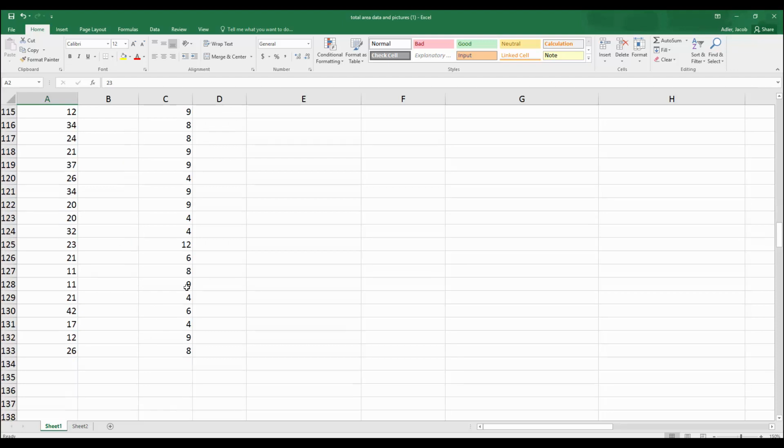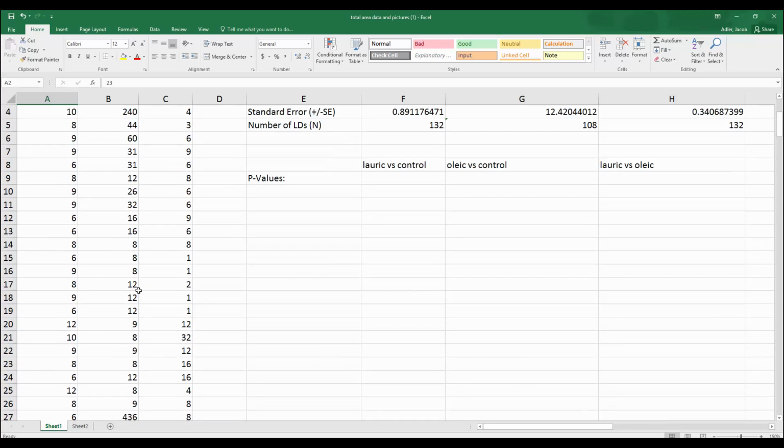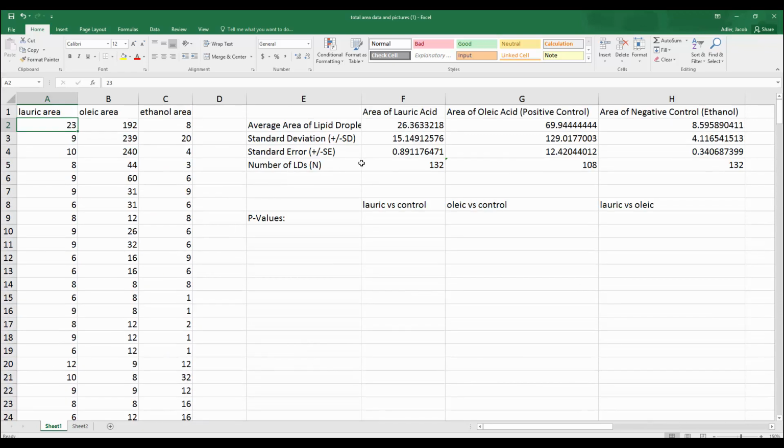And really, you're going to have so many samples, in this case, 132 samples. So you might as well get them as even as possible. And if that means going back to that image and counting a couple more spots, so be it, right? I would encourage you to do that, because otherwise, when you go to compare the numbers, it comes out different. So I've already done all of these here so you have them, but I'm going to show you how I got these answers.